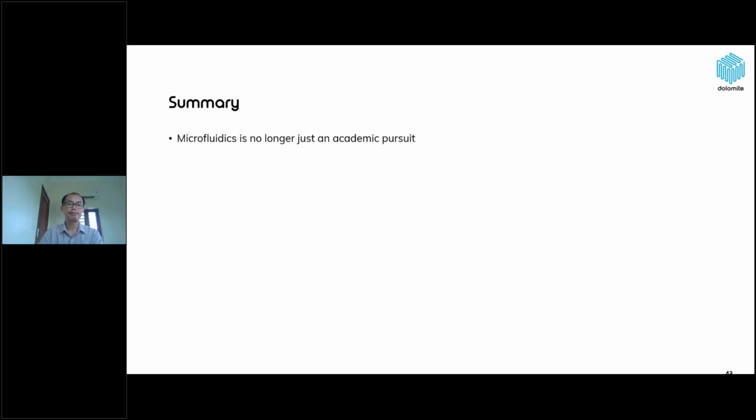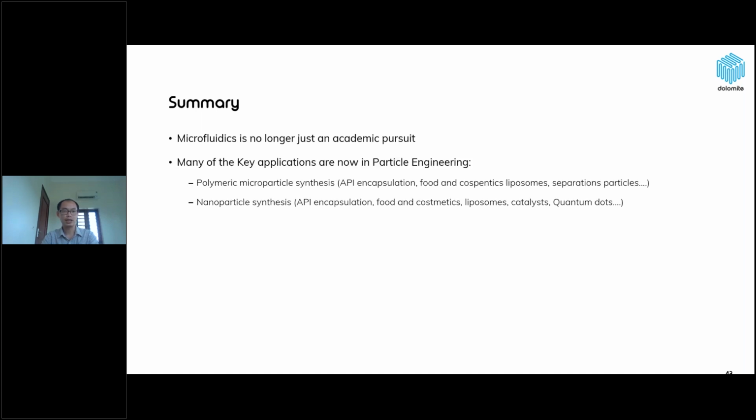So, in summary, microfluidics is no longer just an academic pursuit, and many key applications are now in particle engineering. With polymeric microparticle synthesis for API encapsulation, for food, for cosmetic, liposome or separation particle size, or we can do nanoparticle synthesis for API encapsulation, for food and cosmetic, for liposome, for catalyst, or for quantum dot application.